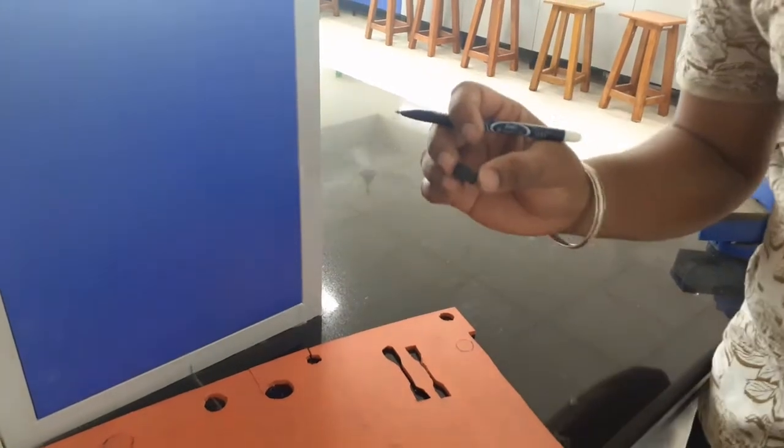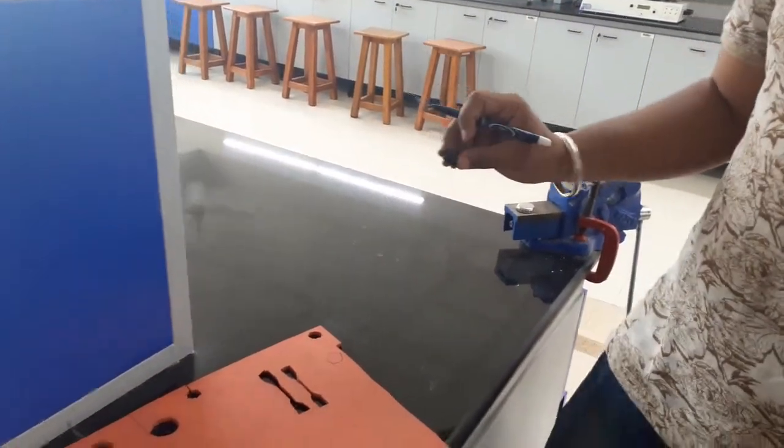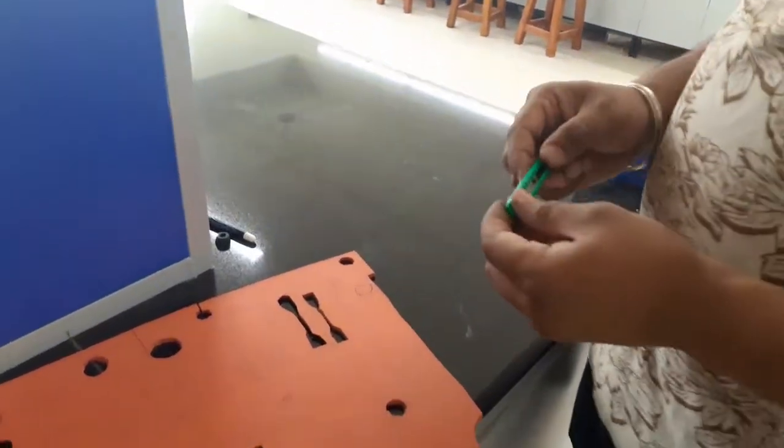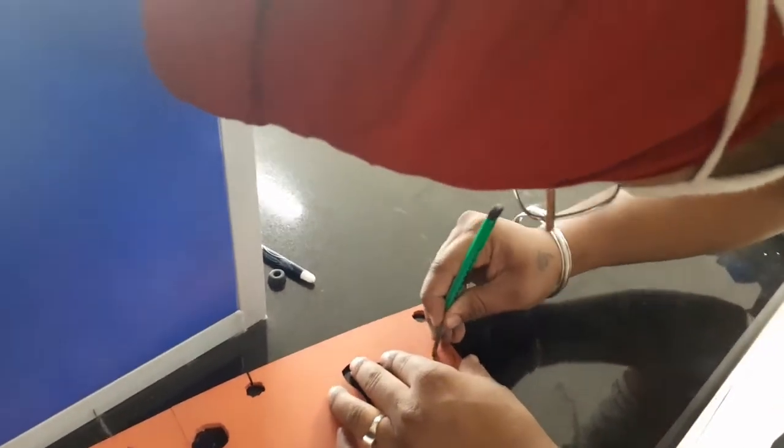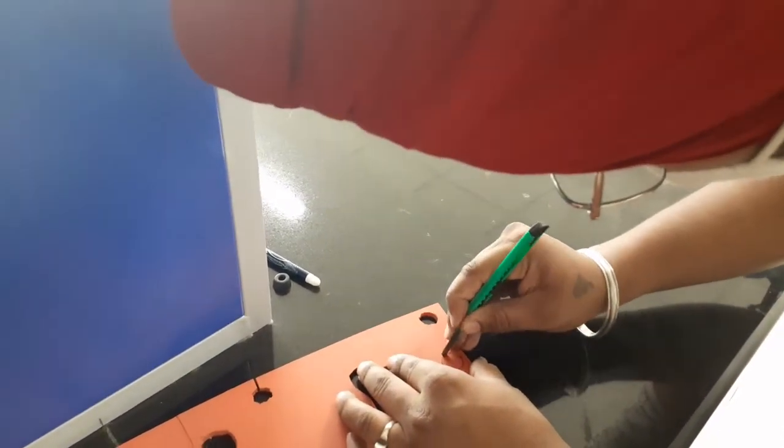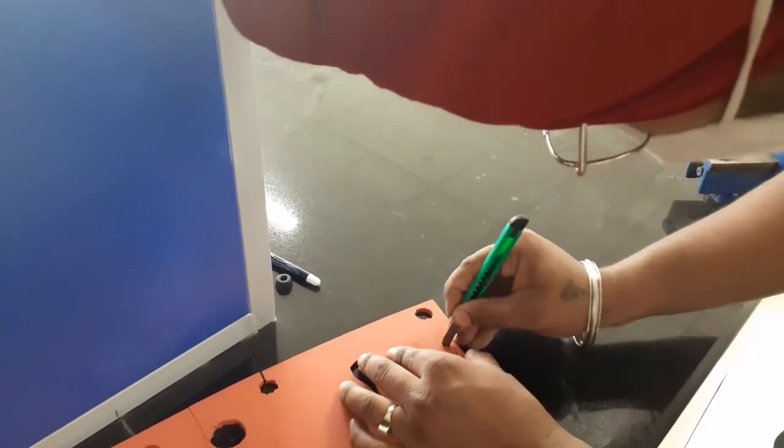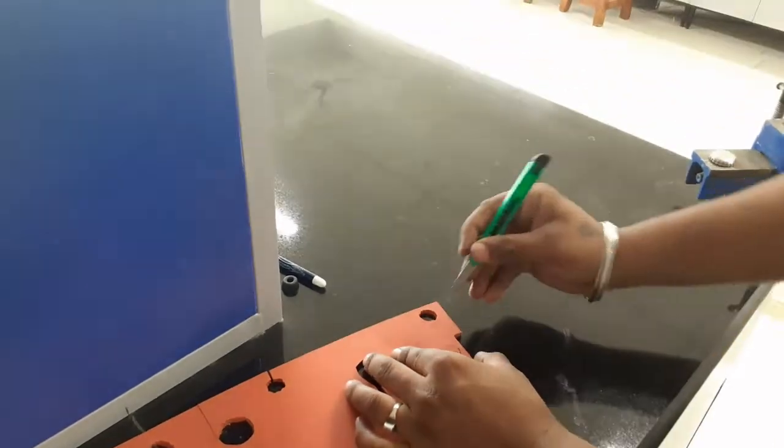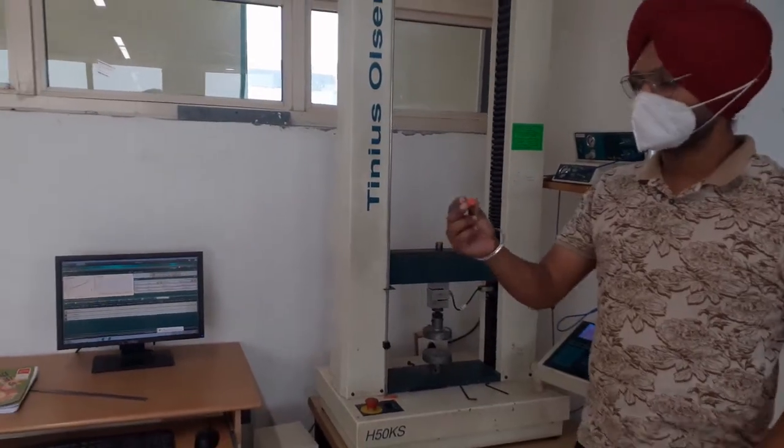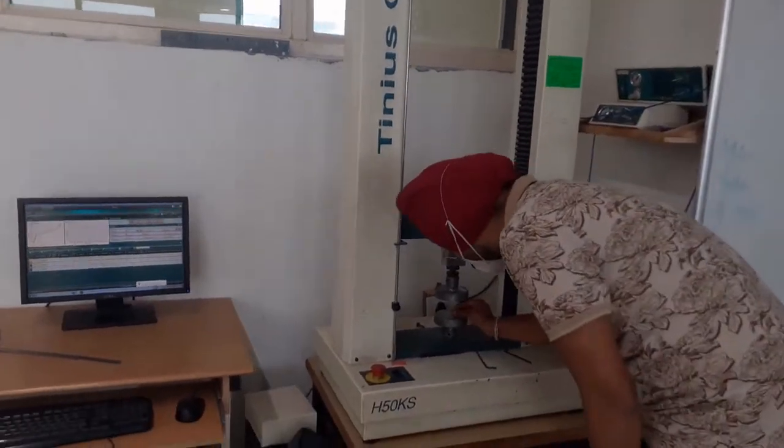We have the specimen of same diameter so we use it for the cutting purpose. By the help of this cutter we cut our sample. This is our sample we cut from the sheet, and now we place the sample in the center of this flat surface.